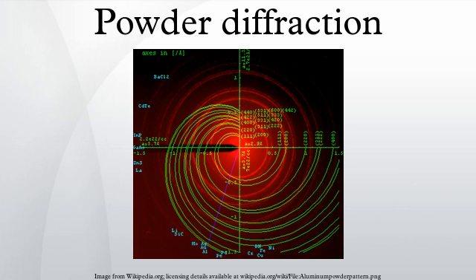A further complication in the case of neutron scattering from hydrogenous materials is the strong incoherent scattering of hydrogen, in barns. This leads to a very high background in neutron diffraction experiments, and may make structural investigations impossible. A common solution is deuteration, that is, replacing the 1H atoms in the sample with deuterium. The incoherent scattering length of deuterium is much smaller, in barns, making structural investigations significantly easier. However, in some systems, replacing hydrogen with deuterium may alter the structural and dynamic properties of interest.